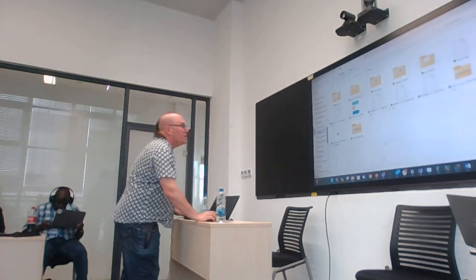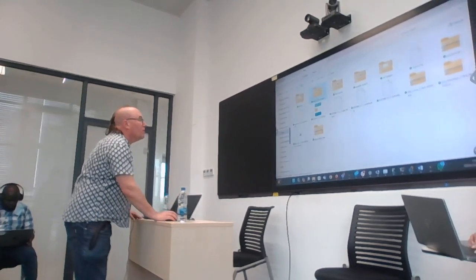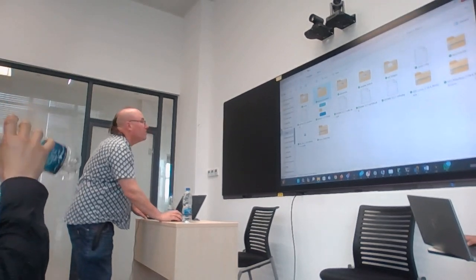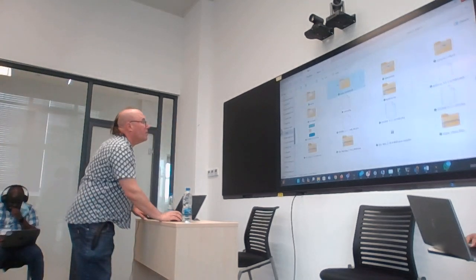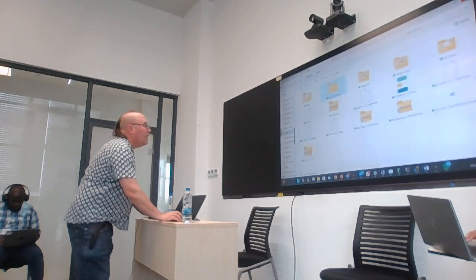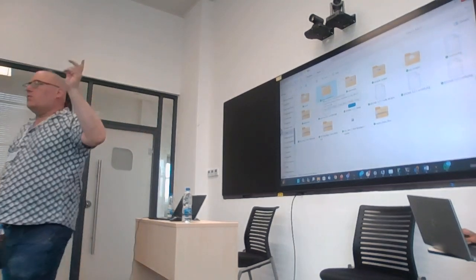So all of these things were on the stick. Okay, I want to highlight this folder. I'm going to make this big. I'm going to say extra large icons. Zoom, zoom, zoom. This one. It's called MPXV normalized.